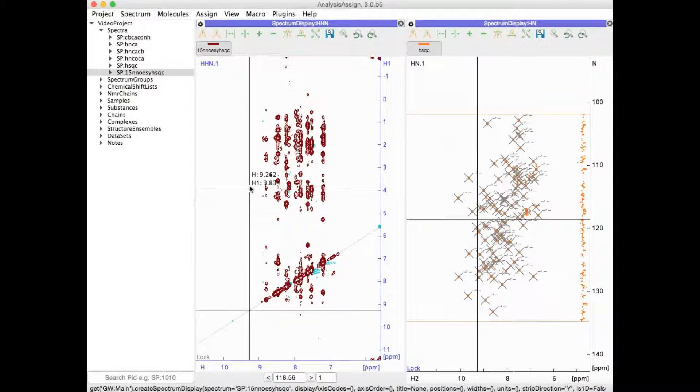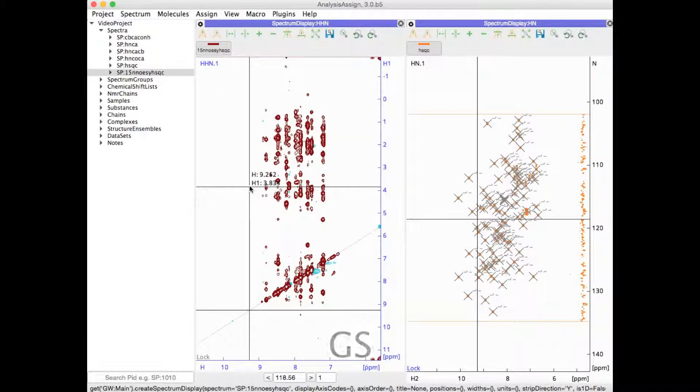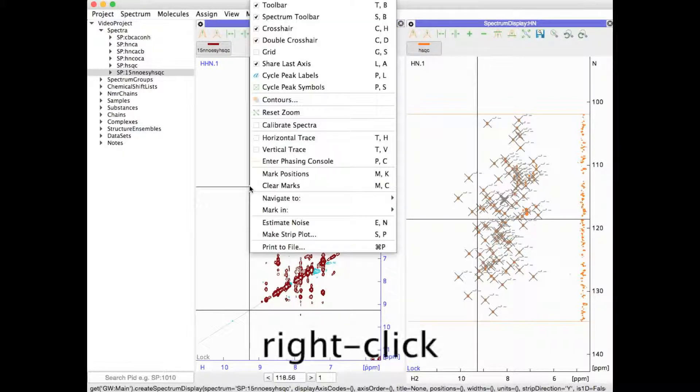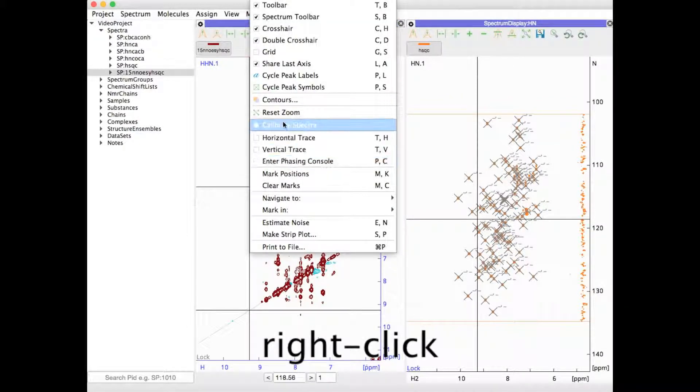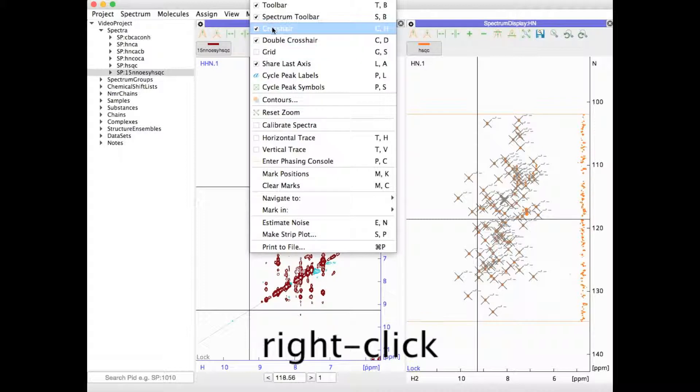You can add grid lines using GS and remove them again. And all of these features are also accessed via the right hand mouse menu.